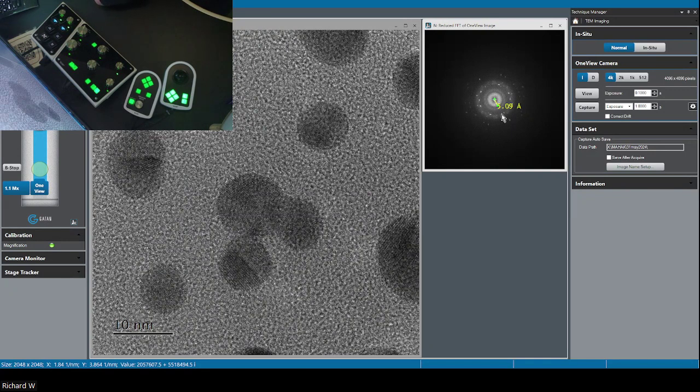I have another question. You mentioned the number of pixels needed to measure the lattice spacing, about 4 to 5 times. Is there a reason to use 4 to 5 times? I think that's just the minimum, right? To see the distance between two peaks.